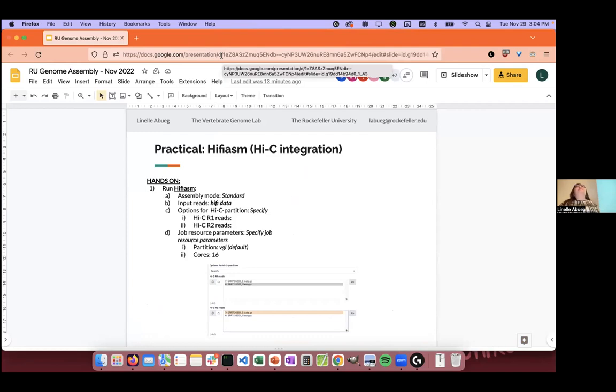How does the accuracy of phasing using Hi-C compare? It's really quite good at preventing intra-contig switch errors. On the blob plot we saw before, there were a lot of contigs that had paternal and maternal hapmers within them. You're not going to get that with the Hi-C; from what we can tell, it's a very little amount. So hap1 might still be a whole maternal contig and a whole paternal contig, because there's just no way to assign them to different assemblies without the SNP info.